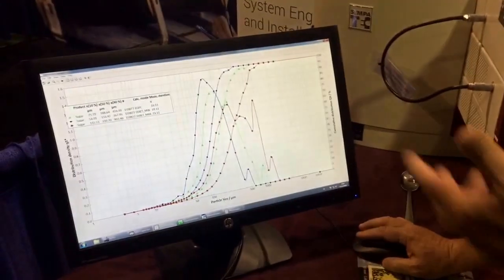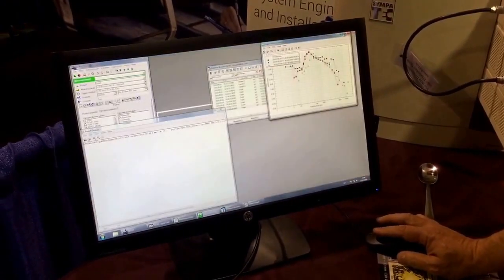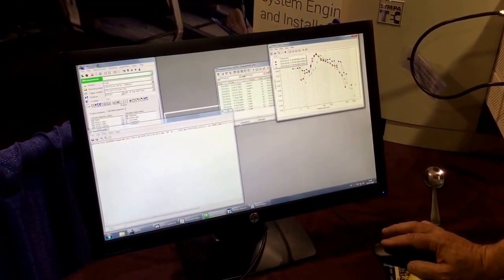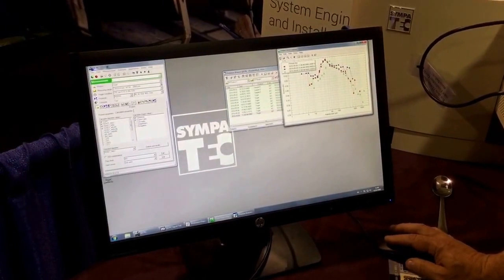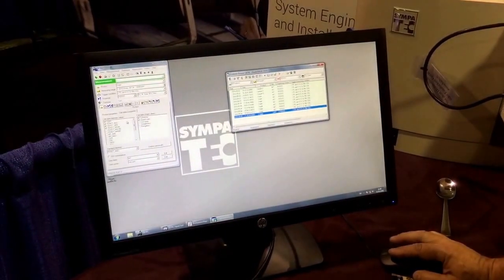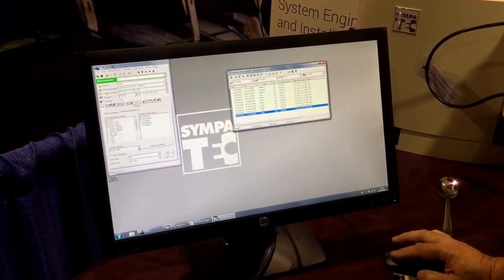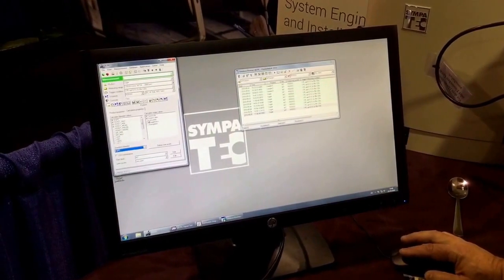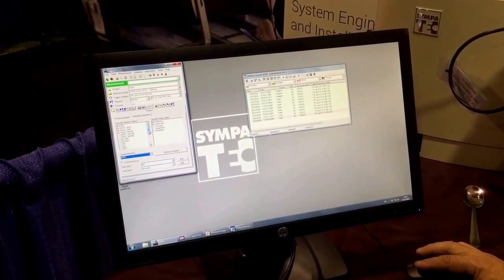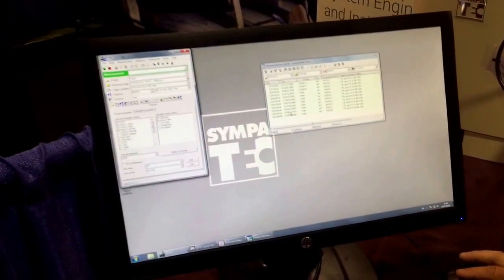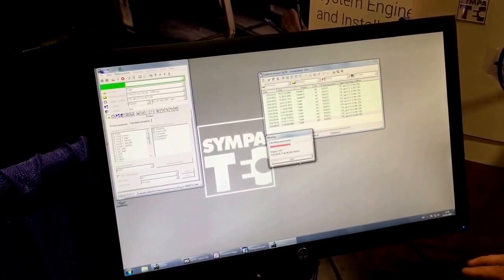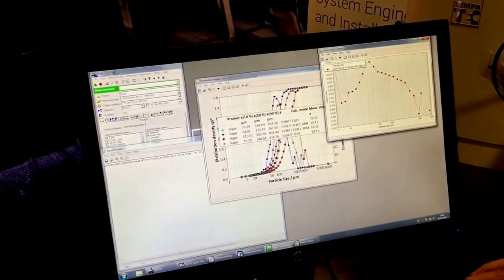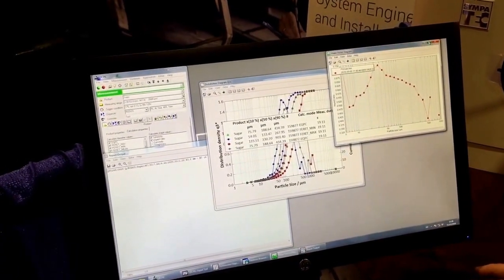So that's size information. I'm going to change this back to EQPC and I'll show you something else that's quite impressive. One of the nice things as well, then you get shape information.